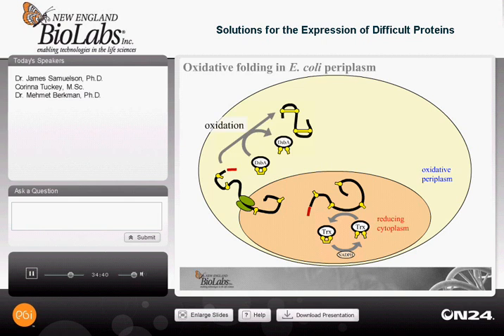This process is very fast and is believed to occur during translocation into the periplasm. And thus, if you have a protein that has a complex pattern of non-consecutive disulfide bonds, more often than not, DsbA will misoxidize and misfold the protein. When the protein is misfolded, another enzyme called DsbC recognizes it and, through a process that we don't truly understand, isomerizes it to its correct native form and makes the protein active.